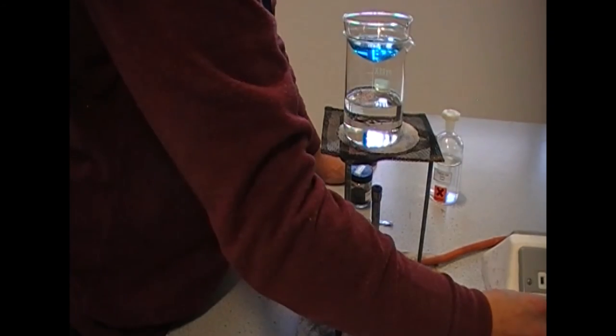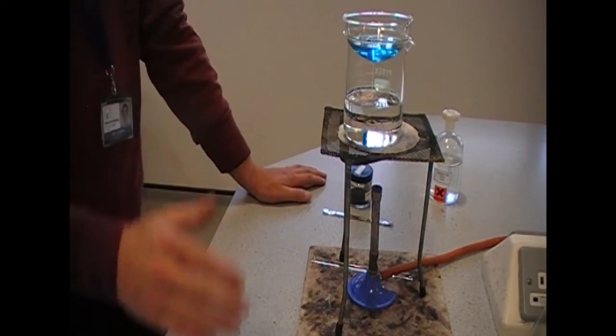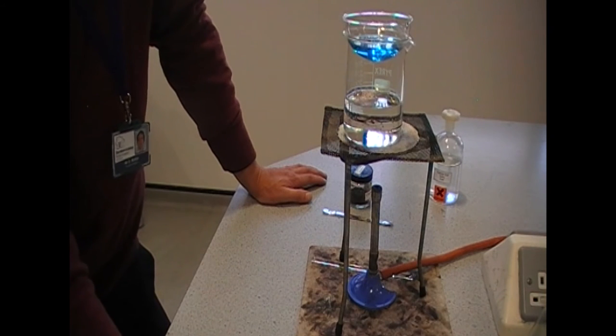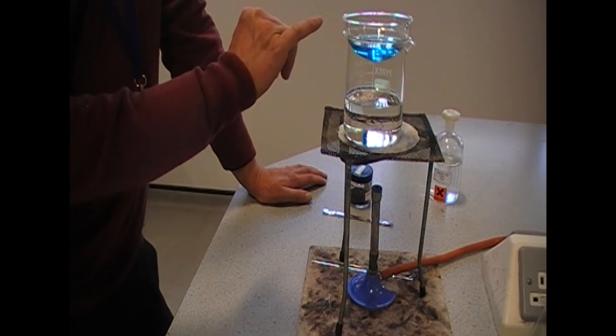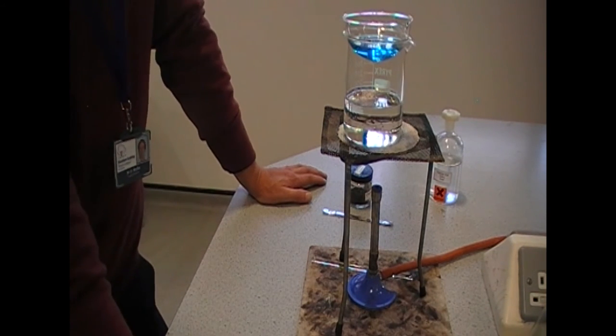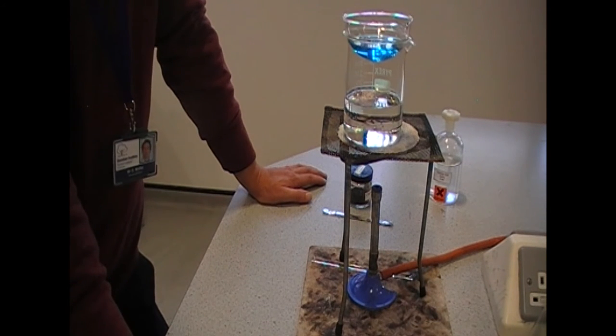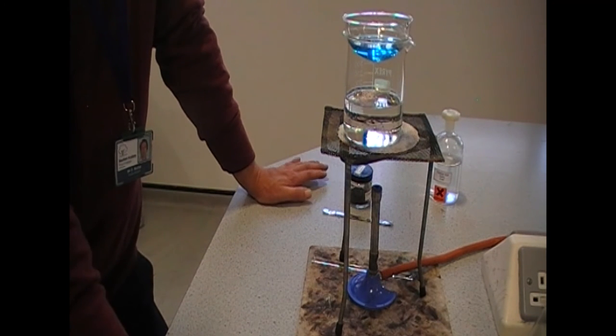Now, pour the contents of the conical flask into your evaporating dish. And now, if you leave that steam from the water bath will then be able to heat this solution and gently, with a bit more control, evaporate away most of, about half of the water.